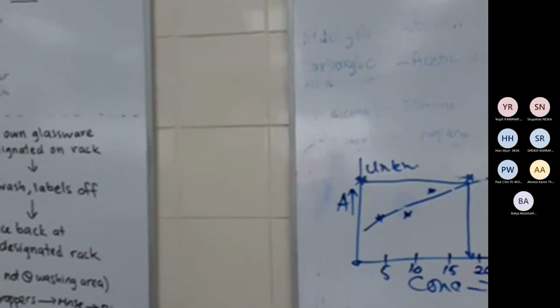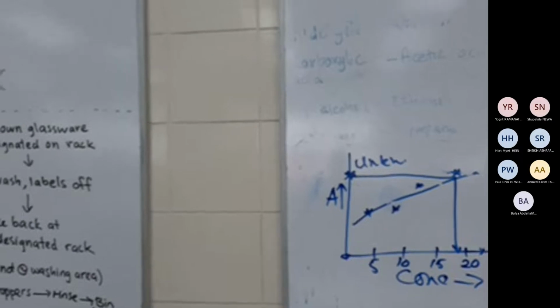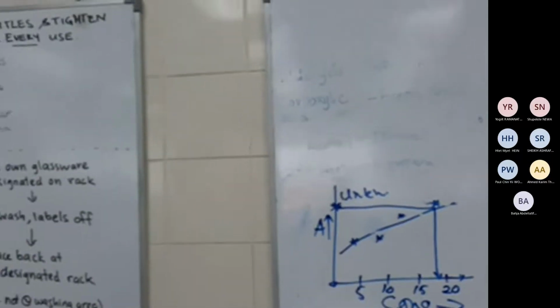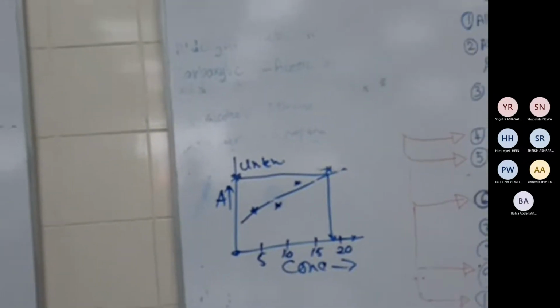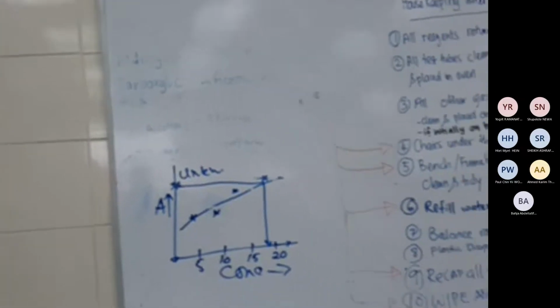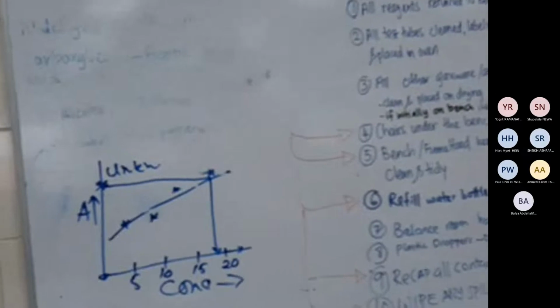And that is why with standards, the more the merrier, right? Here you're making 4, I think. If you make 10, it will be much better and much more precise or accurate, but of course we cannot make that many. But that's what I'm saying, even if it doesn't impact that much, try to make them as neatly, as precisely, as correctly as you can, so that you get a very good result. Right? So yeah, that is one.